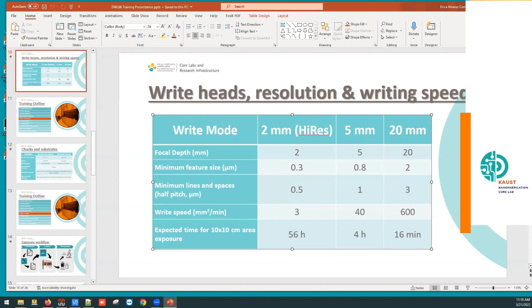The minimum size that you can expose is 300 nanometers. I don't care if you bring it in dark or in clear. You change the polarity, so for example, instead of exposing this, you will have a pitch of 300 nanometers. Maybe this pitch cannot be done.